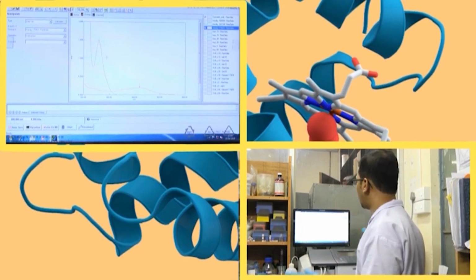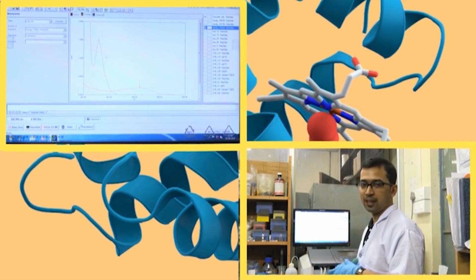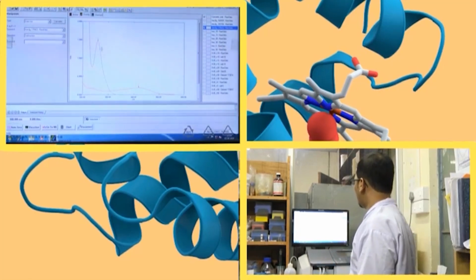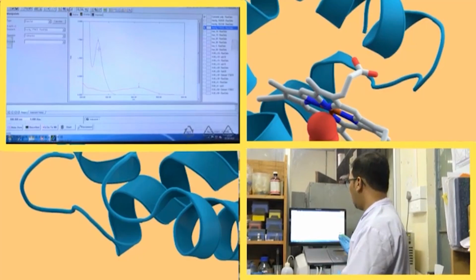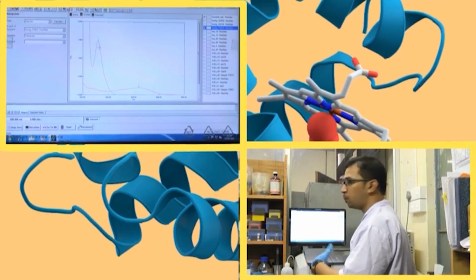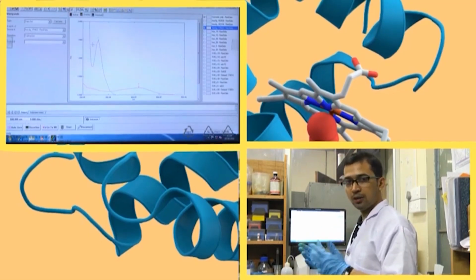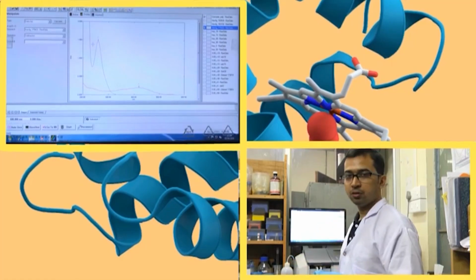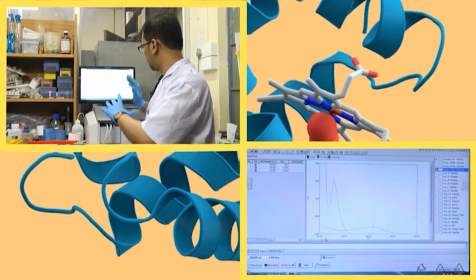For that, I will be taking a slightly lower concentration of gallic acid in this case. You can actually proceed with this one, but it is better not to take the absorbance value above 1. But during experimental cases, if this comes and you get a proper spectra, you can proceed with it. Let me take the dilute solution, then I will show you how the absorbance comes and where the peaks are. So, here we have taken a bit dilute solution of gallic acid.